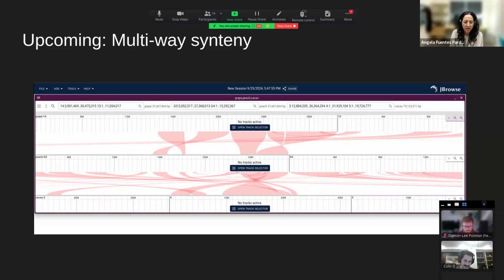That's one question. Another question, if there is any recommendation of how to improve loading or visualization of BAM files, because for example, I think that feature to visualize the breakpoints and inversions and stuff requires uploading BAM files. So I was wondering if there was a recommendation on that front, because also the examples that you showed, I noticed that they were in the order of 1,000 base pairs to 10,000 base pairs.